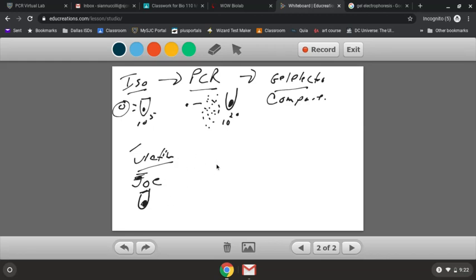And then at the crime scene, we find blood from what we call a suspect. We don't know who it is, but we found blood that's not Joe's. We found blood, tissue, and hairs that don't belong to Joe. So we're going to call that suspect person X, because we don't know who it is. But we were able to isolate that person's DNA from the cells we found at the crime scene, and we were able to PCR that DNA. So we have lots and lots of copies of suspect X's DNA, right?